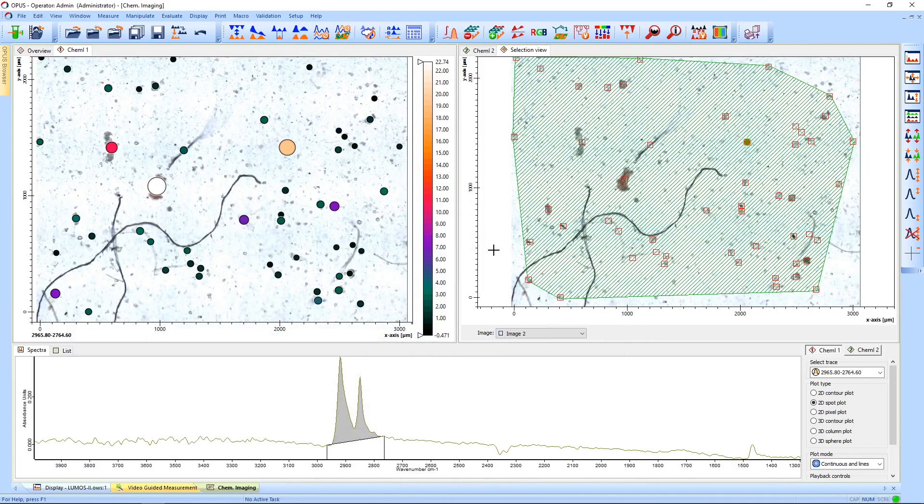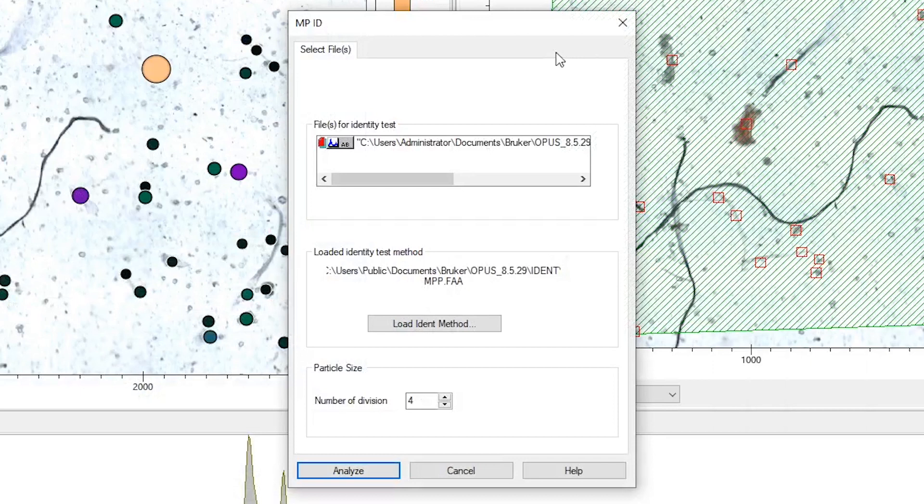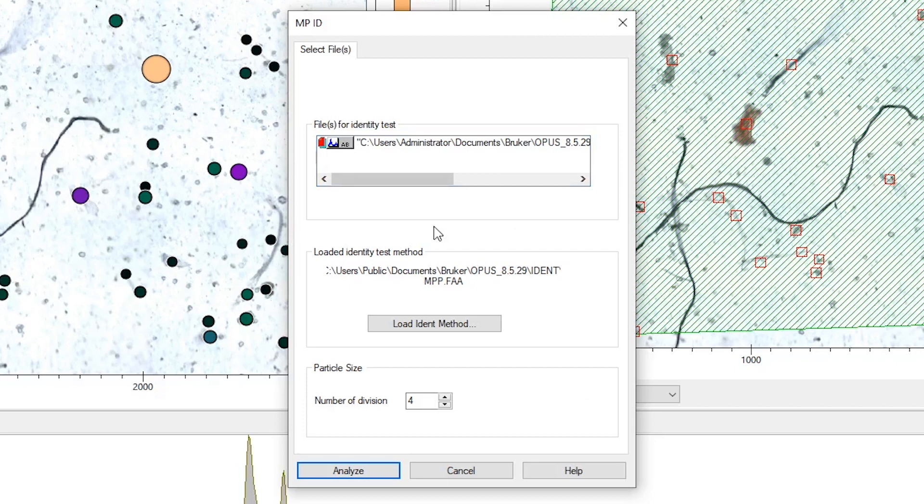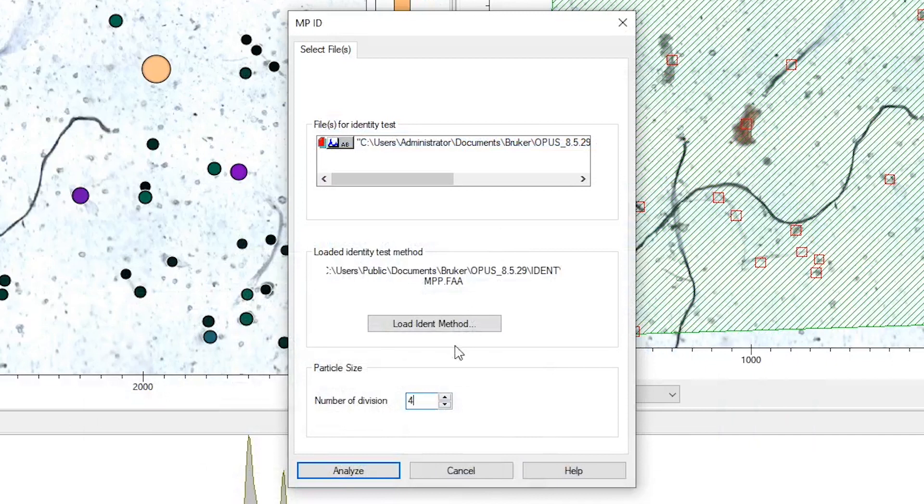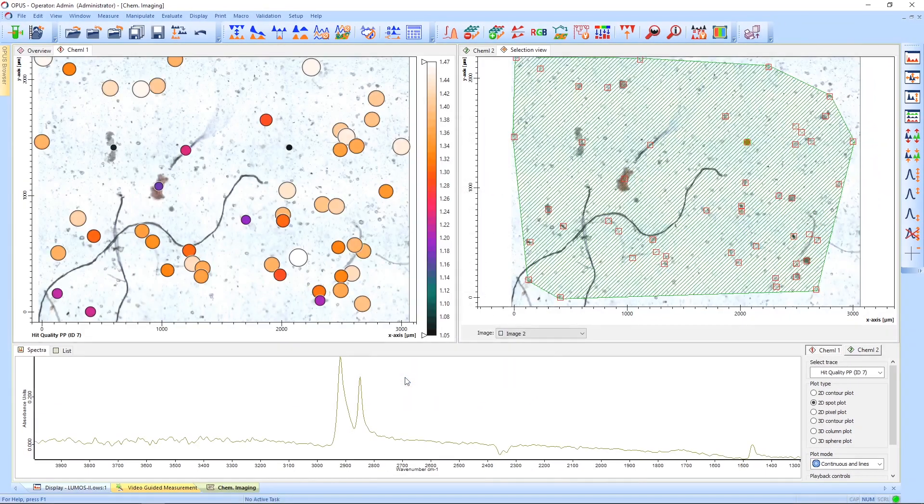To open MPID, simply click on the button in the icon bar and you will be shown this window. We have loaded a predefined method for our sample, but you can define your own methods for your day-to-day routine. Additionally, you can adjust the number of size divisions. Since our sample is very diverse, we are going to take a few more and click Analyze.